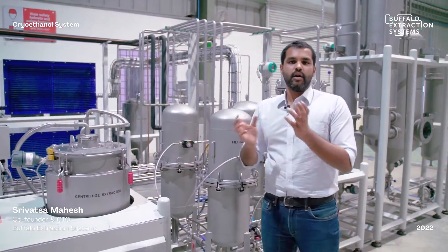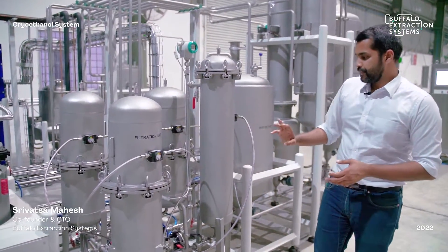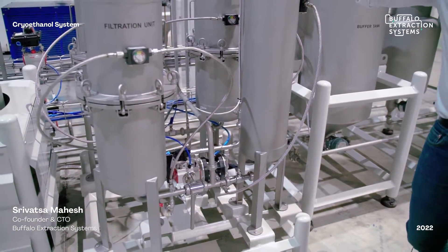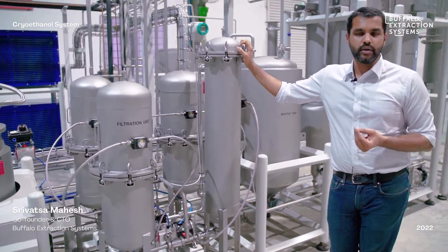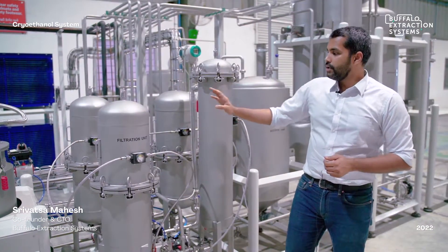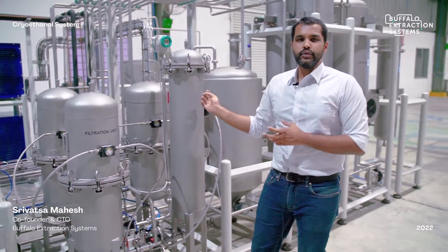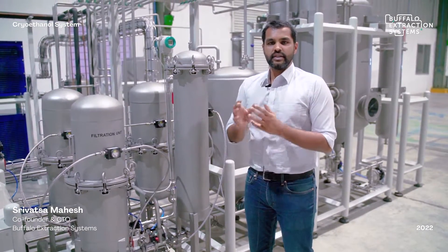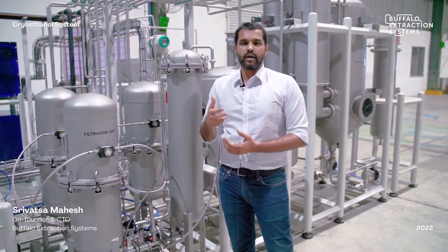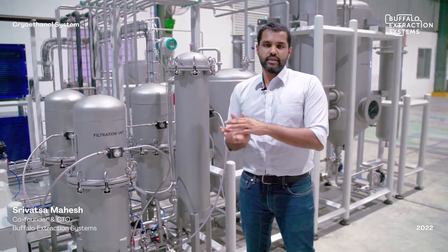The resulting ethanol and oil from the centrifuge passes through a four-stage filtration skid: one cartridge filter, two DE lenticular filters, and one sintered rod carbon filter. This progressive filtration removes contaminants and unwanted particles, resulting in a very clear, honey-like coloured extract. The next step is simply to remove the ethanol from it.